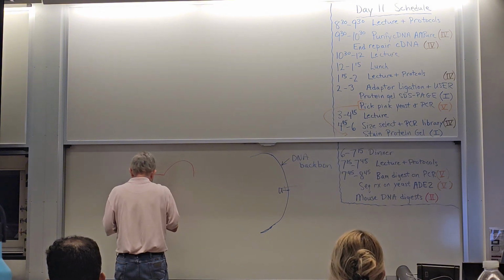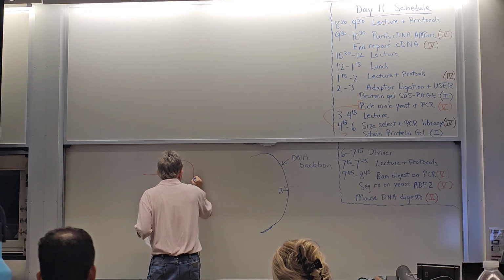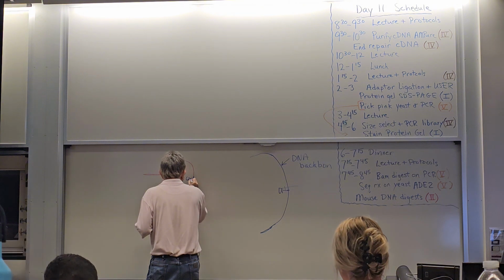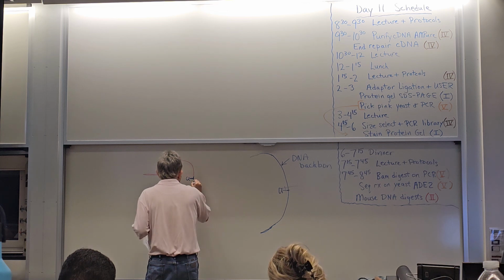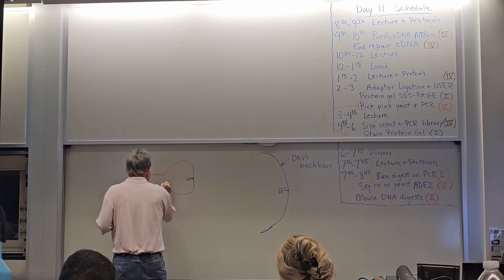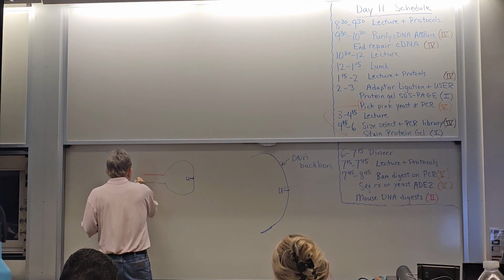And then we're going to have that one nucleotide with the U, and I'll do that in blue just so it looks different. I'll stick the U there, so you know what's happening. And then the other side will be green. I'm not a great artist, so I'm doing the best I can here. And then we've got that single T overhang.